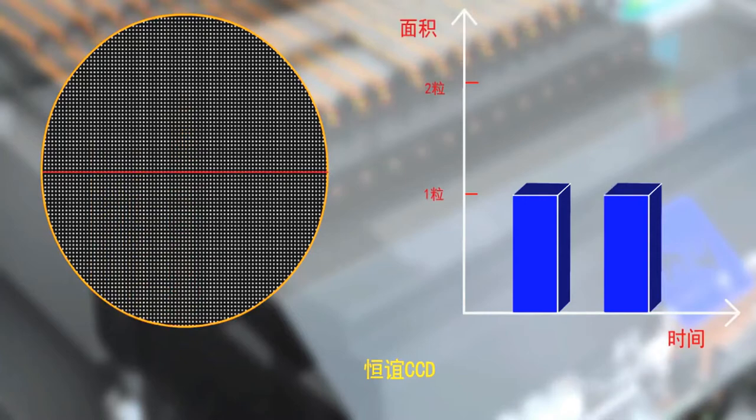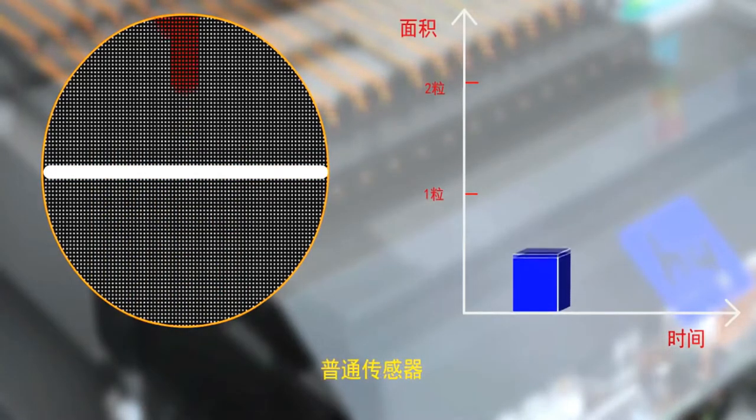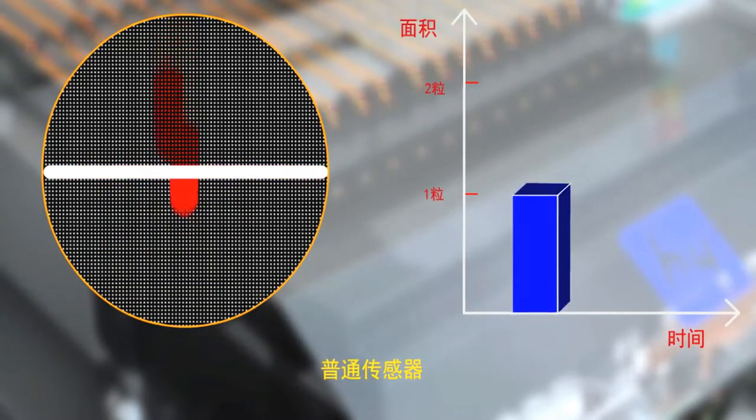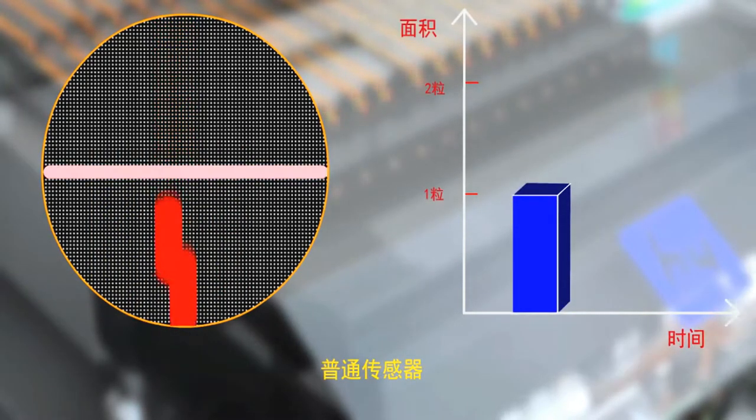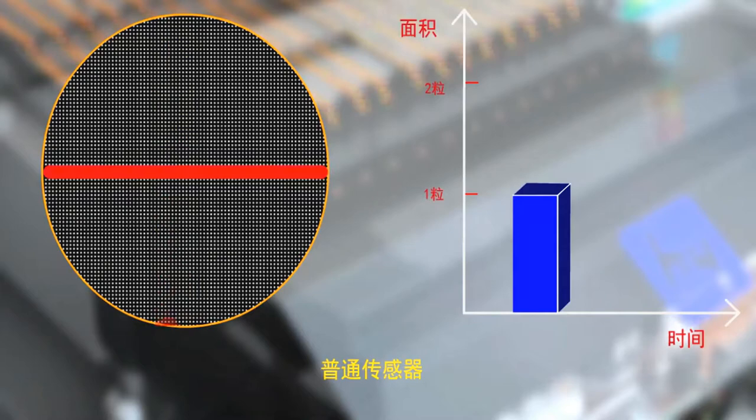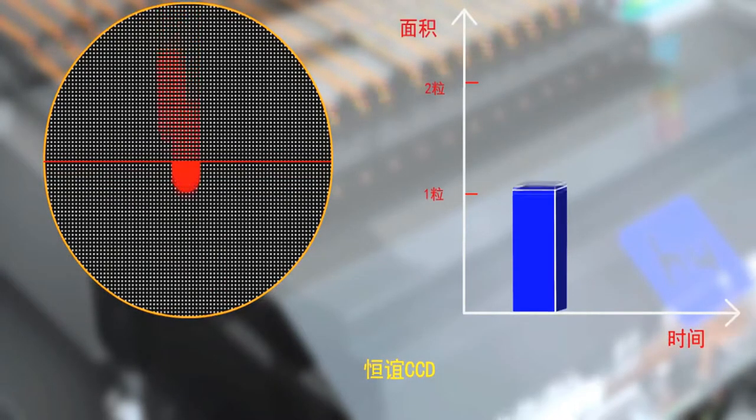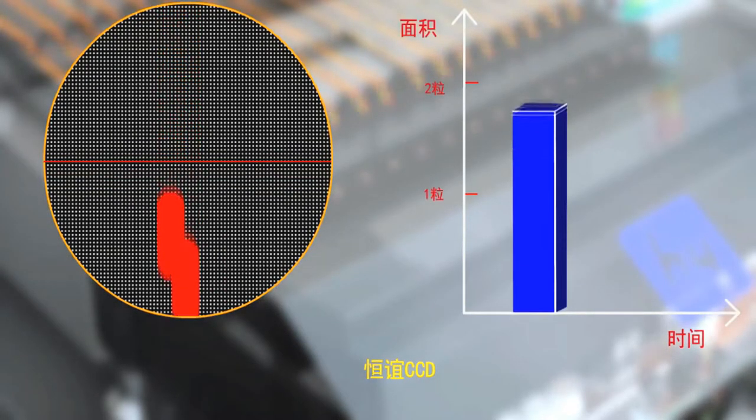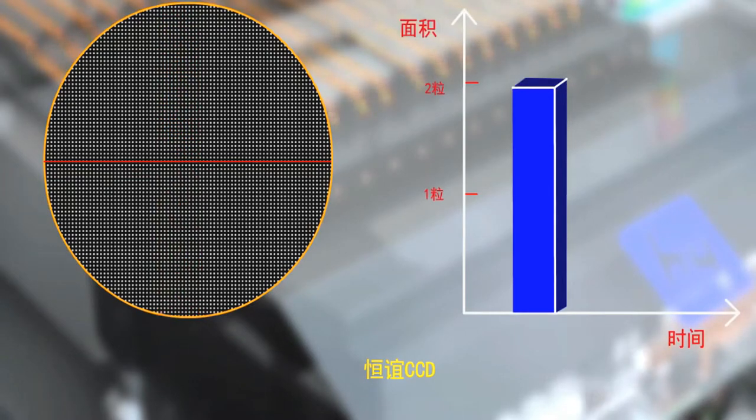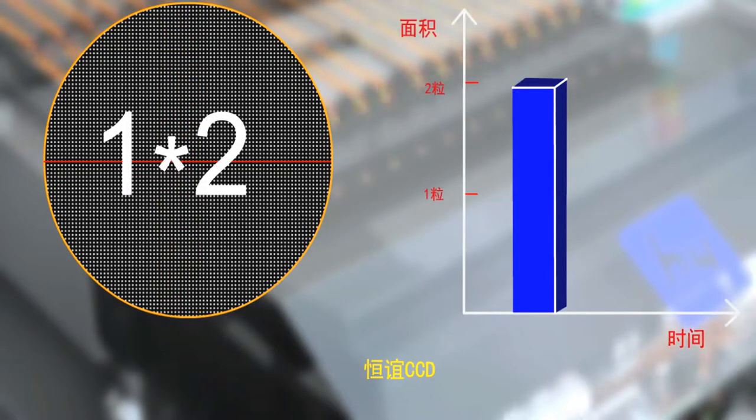Second, when overlapped tablets enter the counting sensing area, the counting of the common counting machine is 1, and the counting through CCD technology of Heng Yi equipment is 2.